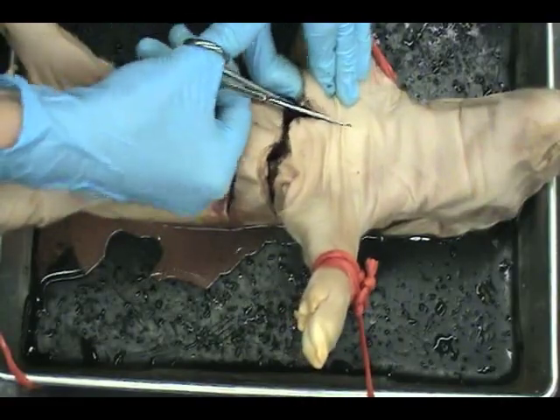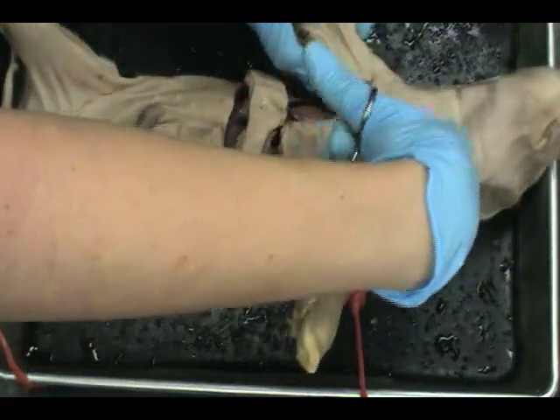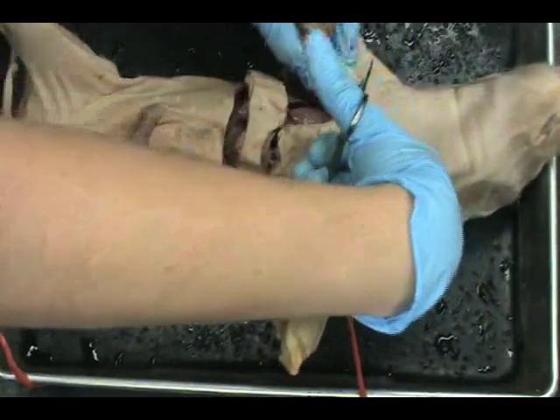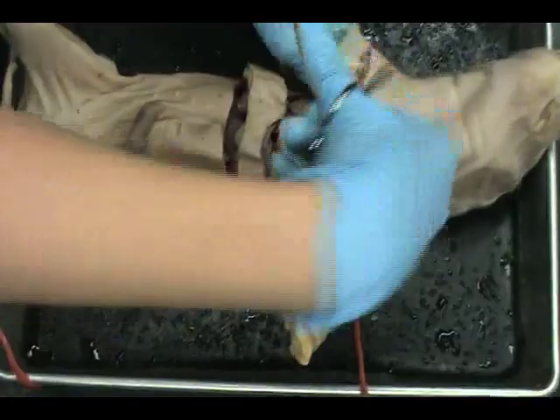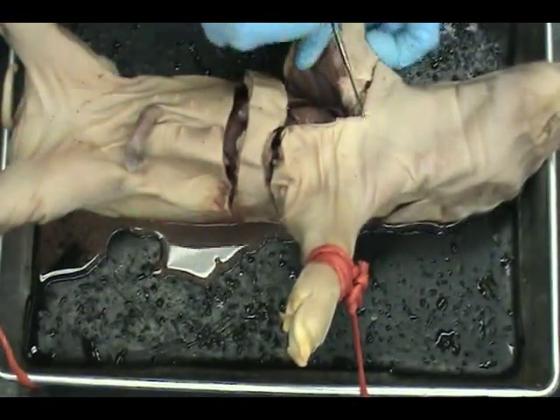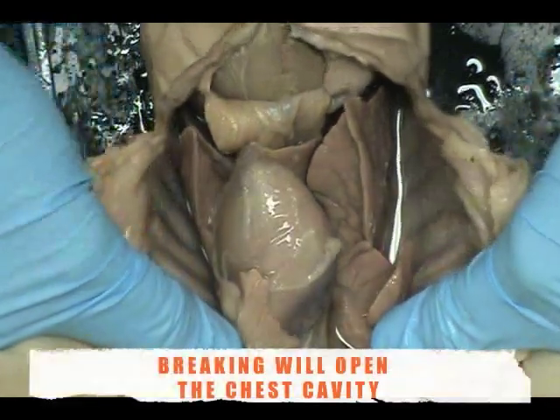Cut towards the anterior of the pig, then bring the cuts out over the shoulder blades. Push down and break the ribs.